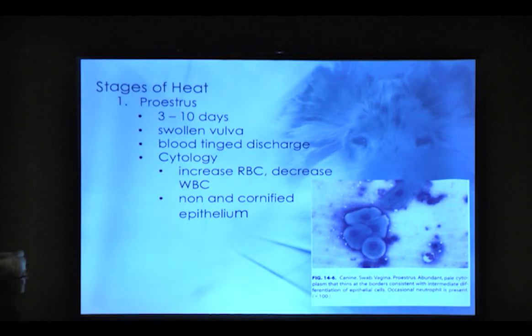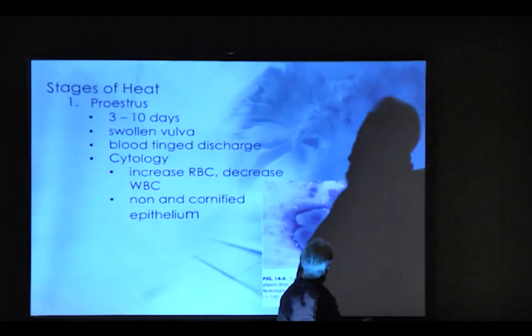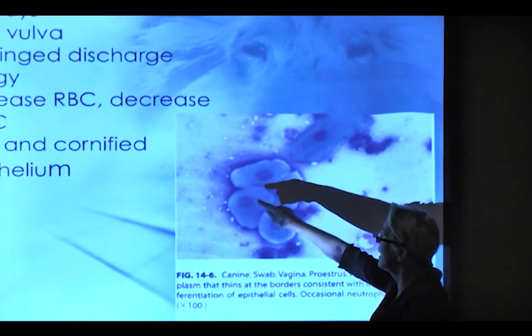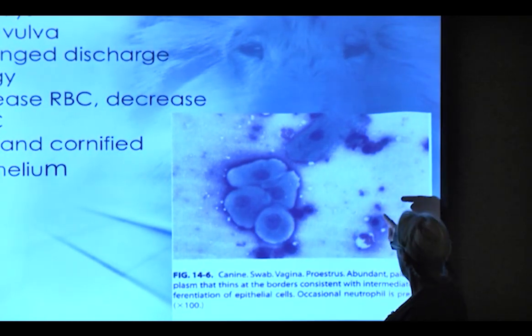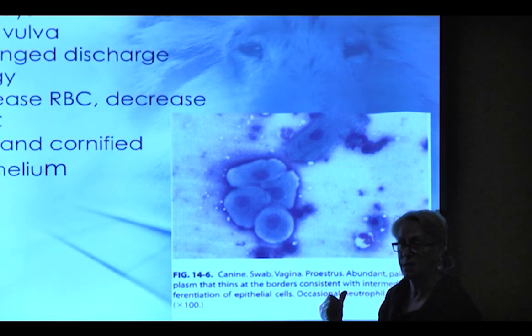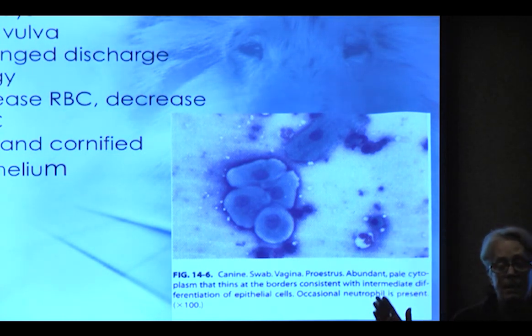And this is what proestrus looks like. You have really big round cells with really big nuclei, okay? This is before, and then you've got all these little red blood cells all around. That's what proestrus looks like. And a bitch is not ready to be bred. If you're breeding by cytologies, the bitch is just early in her heat cycle. Okay, next one.